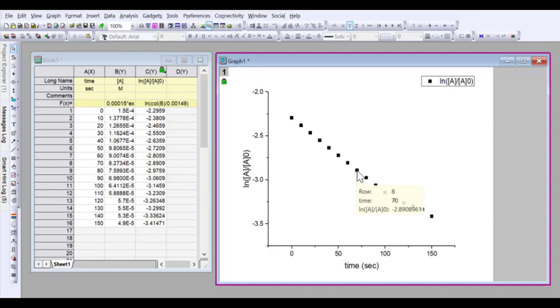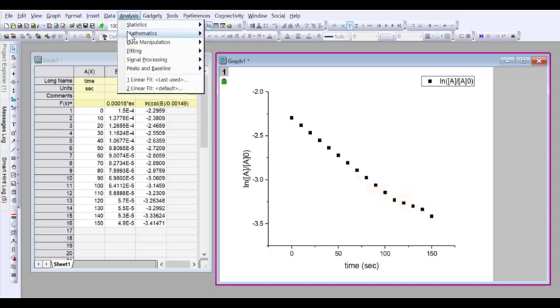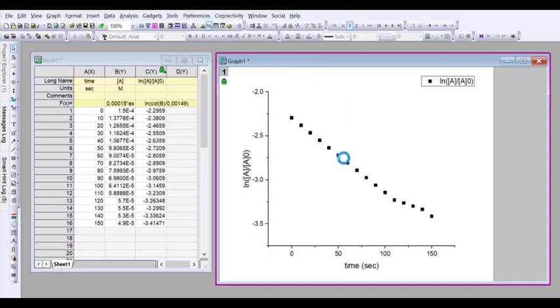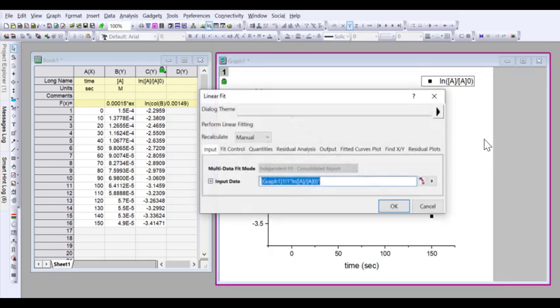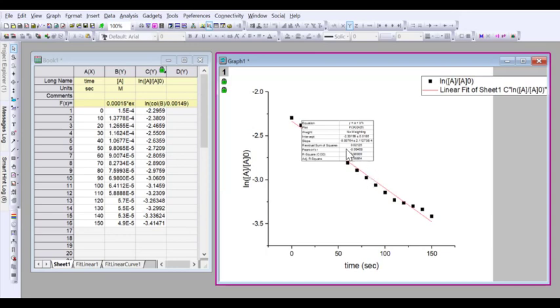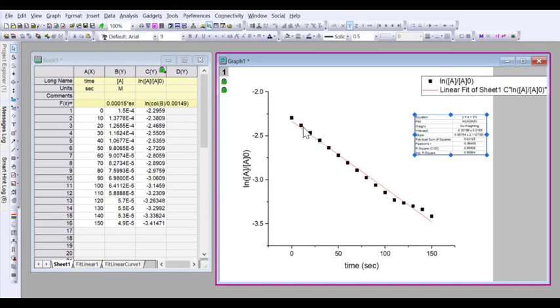So if I go to analysis, fitting linear fit, and open up the dialog, default is fine, I'll just press OK. So it's giving me this linear fit of this curve.